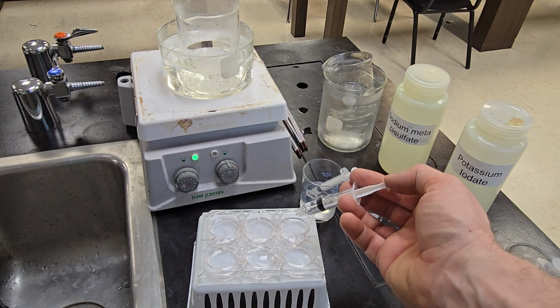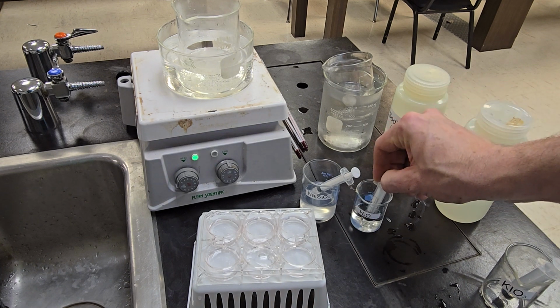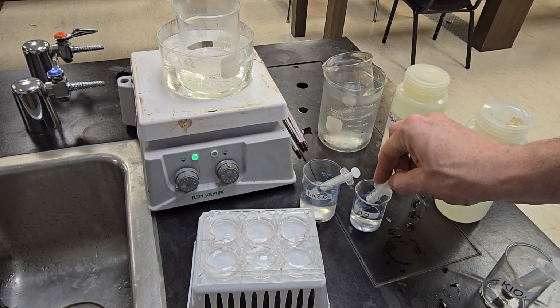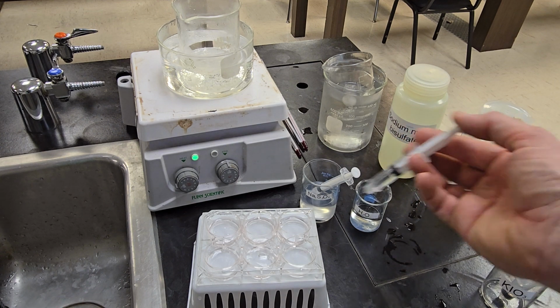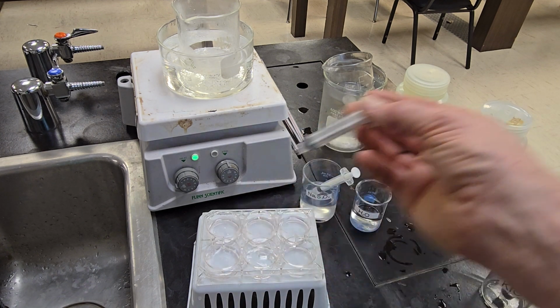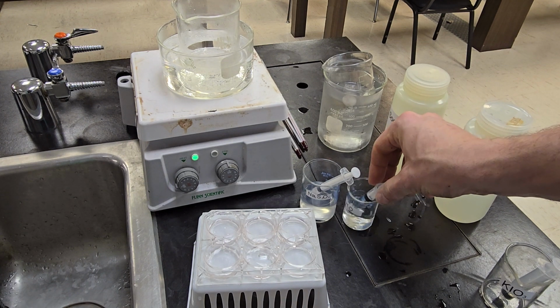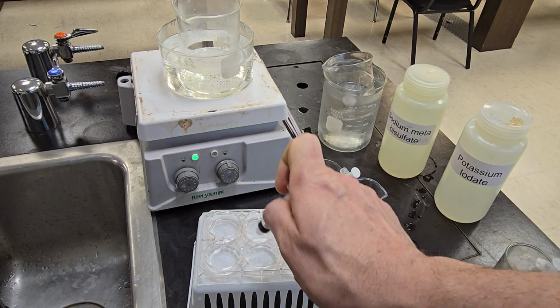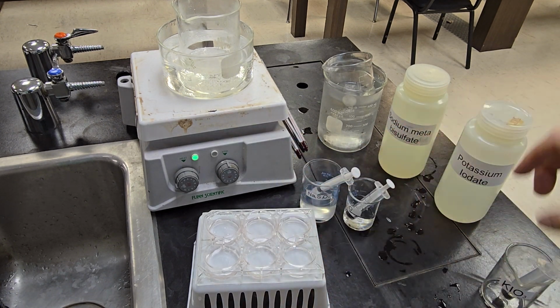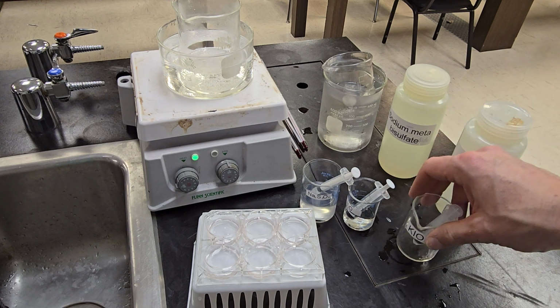Plate number 3, well number 3, gets 2 milliliters of water. Well number 4 gets 3. Well number 5 gets 4. So I have the same amount of liquid in every well with different concentrations of potassium iodate, KIO3.